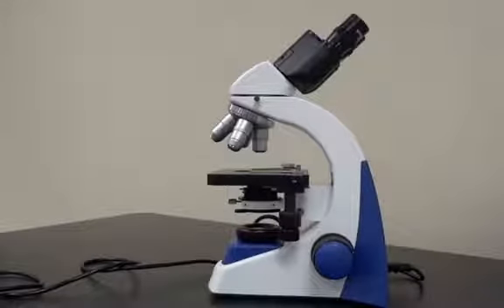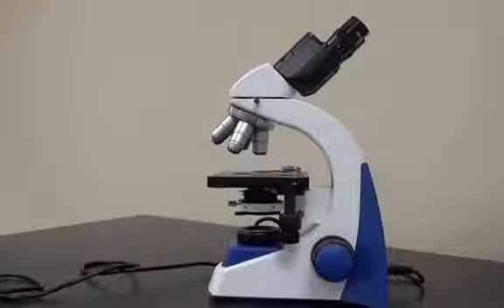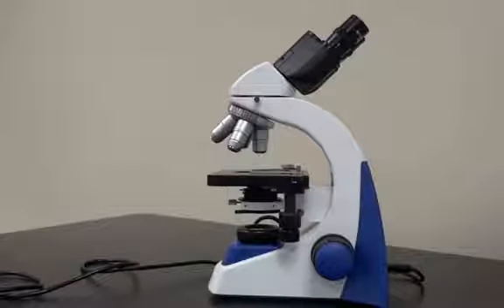I'm going to walk you through today, if you will, the anatomy and physiology of the microscope. Basically the different structural points on a microscope and then how to properly use it. So we'll walk through the procedure of how to use the microscope properly.